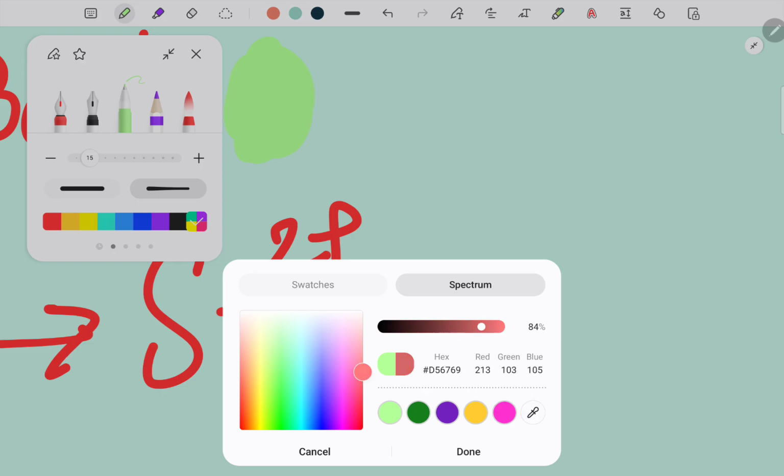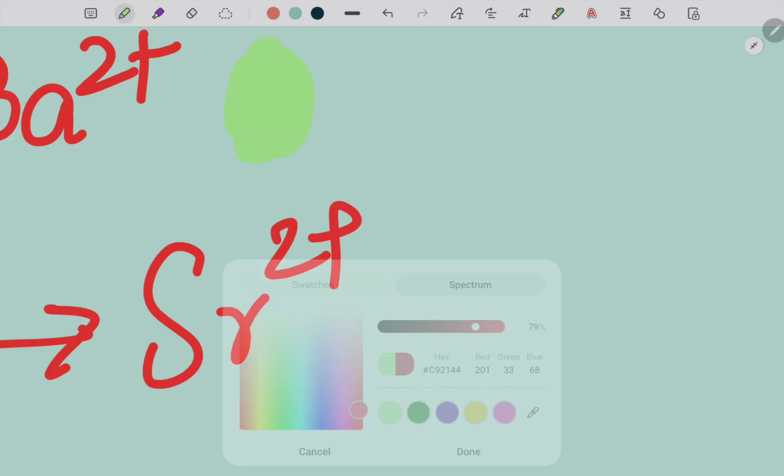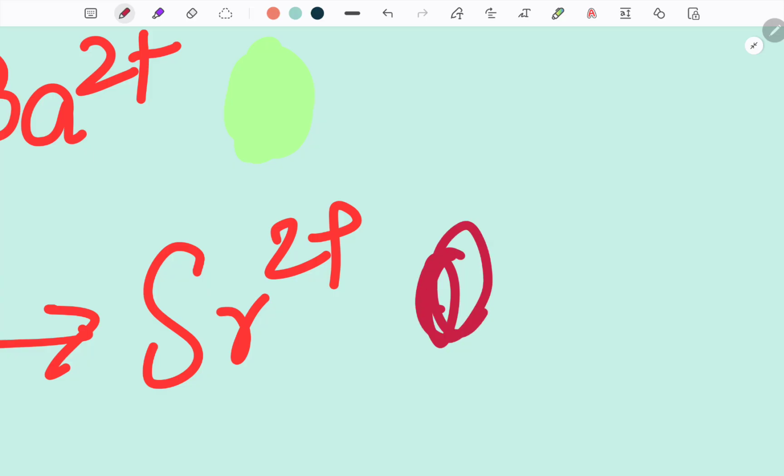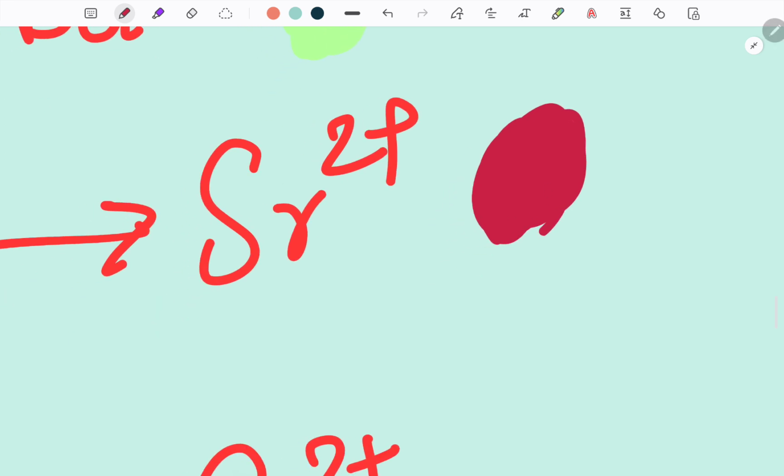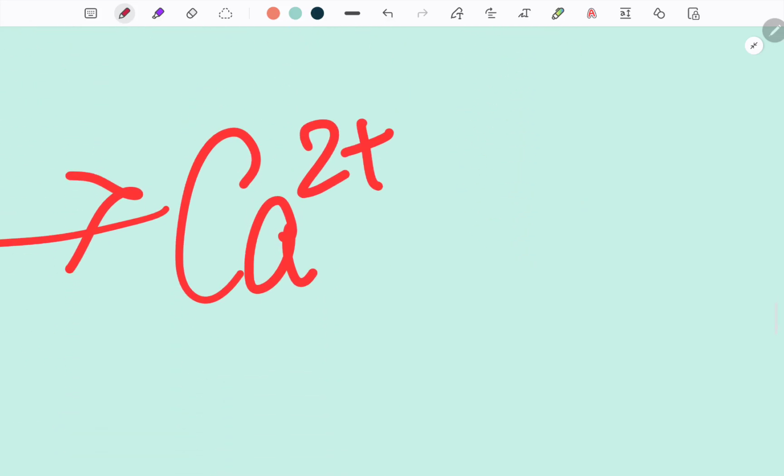So if I were to describe the crimson red color, I think this is the color. Yeah, this is crimson red. Of course, the flame won't be as dark as this. The flame will be getting a very light hint of the color, but it would be a shade of this color that I'm showing you on the screen.